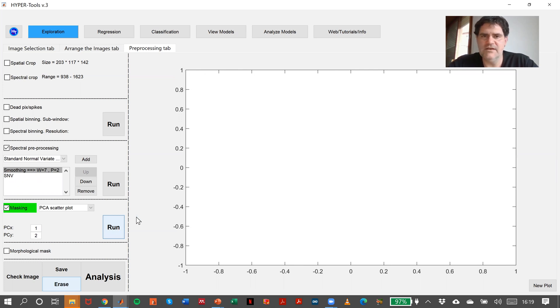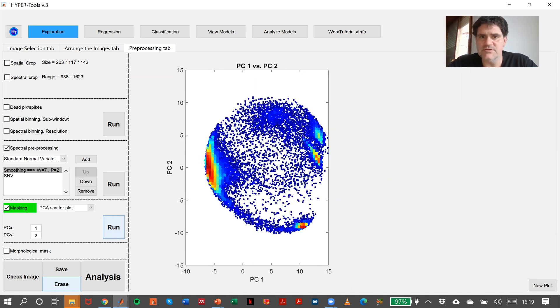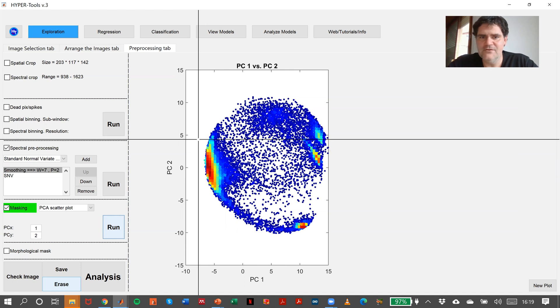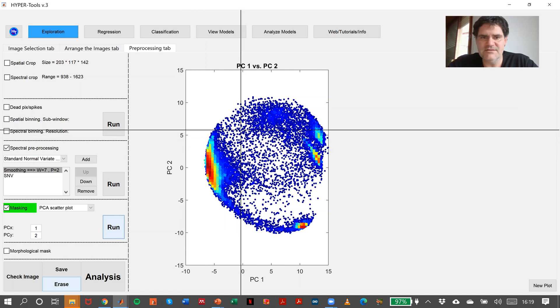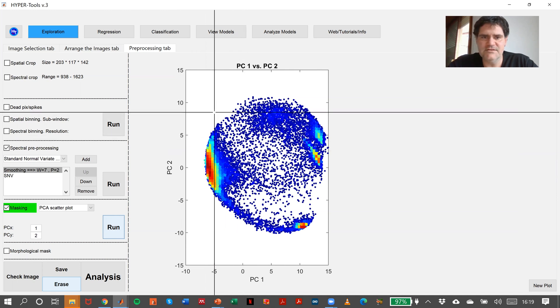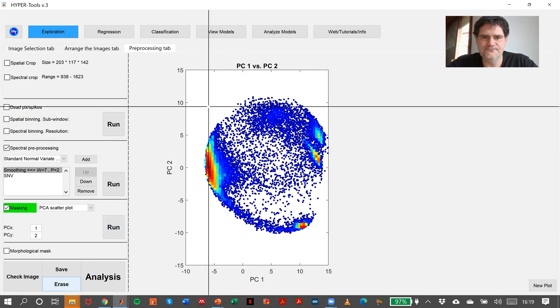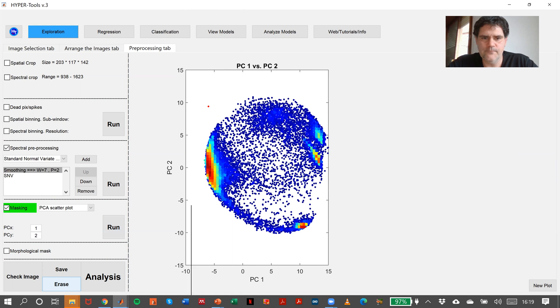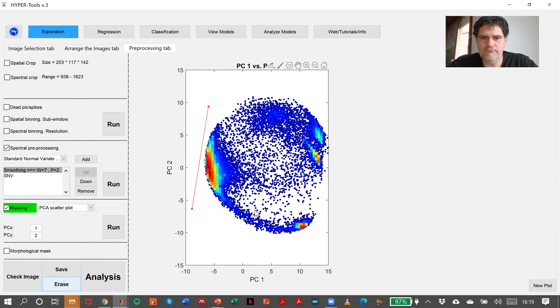It takes a little bit because it's making a PCA on the preprocessed image. In this case, it's this way. So let me just take, for instance, this part.